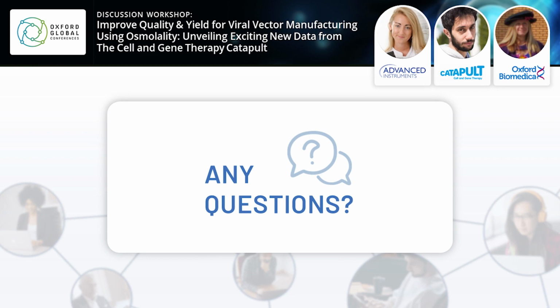And I have Lucia's response now to the previous question, which was how laborious is osmolality testing of the vectors? And she responds, the testing procedure is very simple and requires minimal sample volumes and timing. To test one standard solution and one sample, it takes around 15 minutes. The training of new operators requires around 1 hour, and so far we have encountered no issues raised by other users on performing osmolality testing with our osmometer. So thank you very much, Lucia, for that.